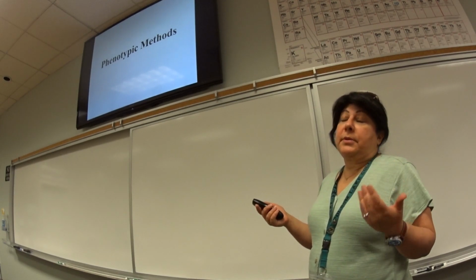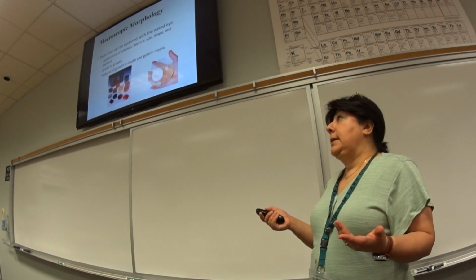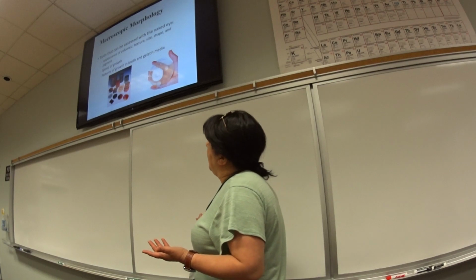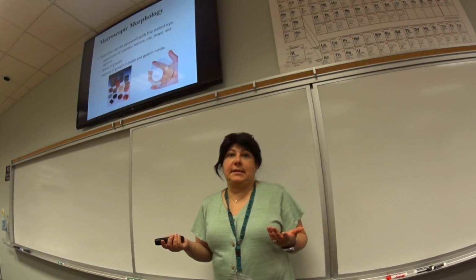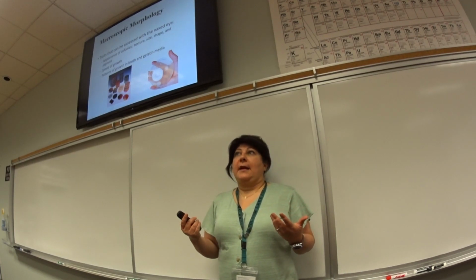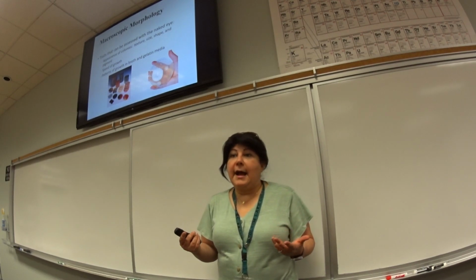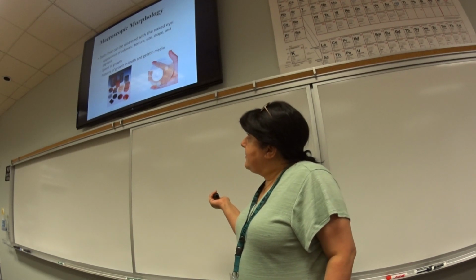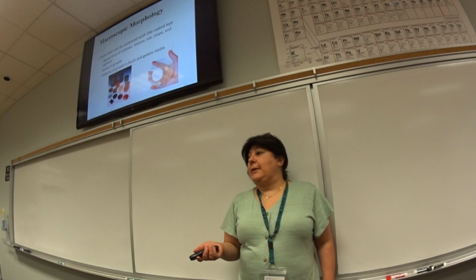When we use diagnostic techniques, one of the first things they do in general is grow the bacteria and look at their phenotypic characteristics, right? These are physical characteristics of the bacteria based on the genome that they have, so we can actually look at their phenotypes. One of the easiest ways is you grow it, you isolate it, you look at the bacteria.